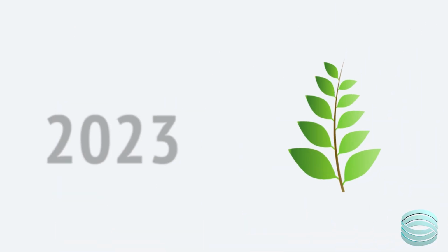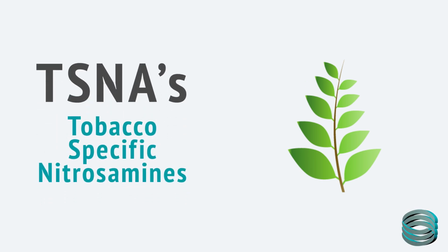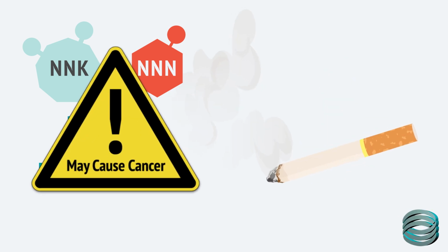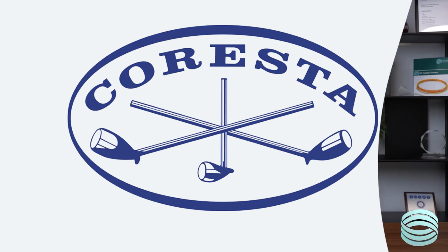In the tobacco industry, nitrosamines have been a focus for decades, especially a subset known as TSNAs, or tobacco-specific nitrosamines. These include compounds like NNK and NNN, which form during curing and are among the most harmful chemicals found in cigarette smoke. Because of this, they're routinely tested using validated methods developed by CORESTA, the Cooperation Centre for Scientific Research Relative to Tobacco. CORESTA methods typically rely on GC-TEA or LCMS setups, depending on the target compound and the sample type. These aren't fringe methods. They're widely used across regulatory labs and industry to meet strict safety standards. In fact, some regions set maximum allowable levels of TSNAs in tobacco products based directly on the CORESTA protocols.